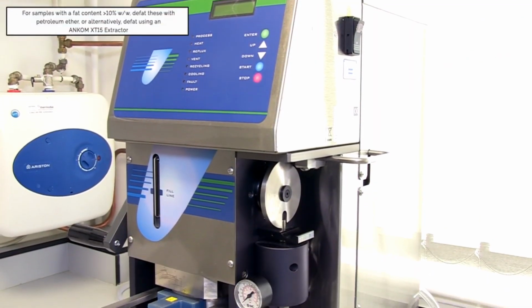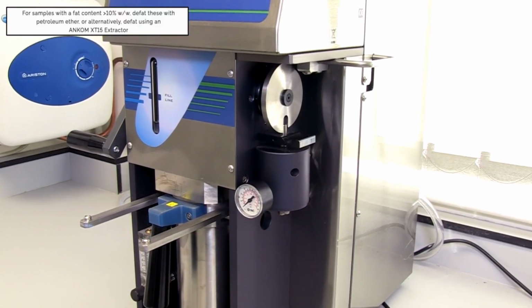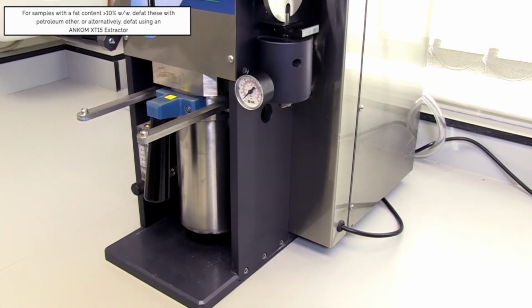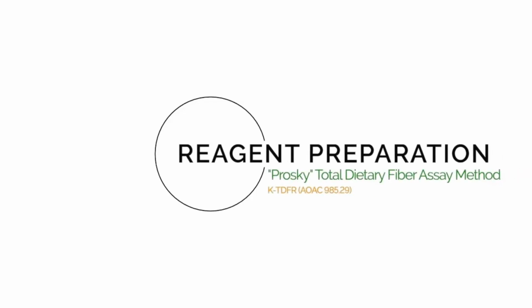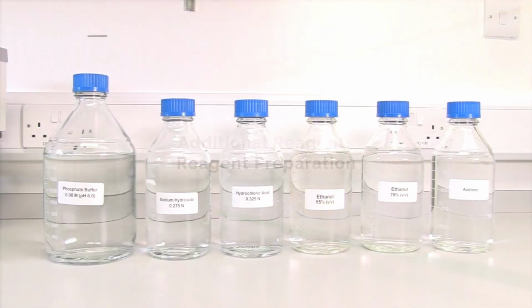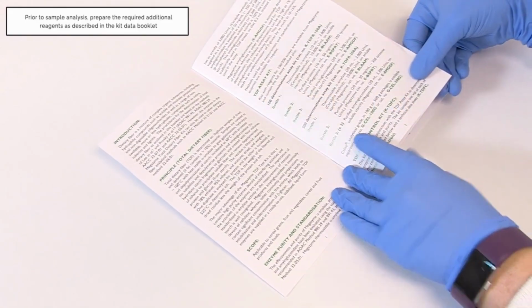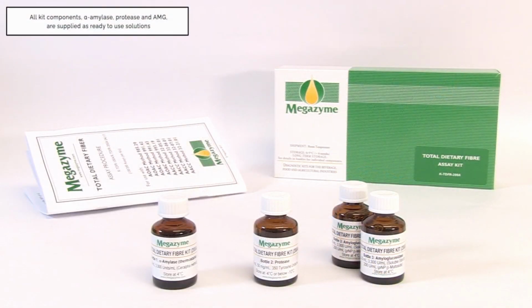For samples with a fat content above 10% weight per weight, defat these with petroleum ether according to the booklet, or alternatively defat using an Ankom XT15 extractor. Prior to sample analysis, prepare the required additional reagents as described in the kit data booklet. All of the kit components, α-amylase, protease and amyloglucosidase, are supplied as ready-to-use solutions.